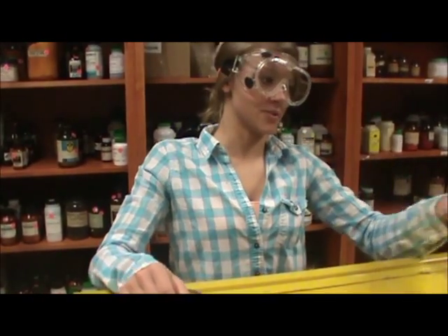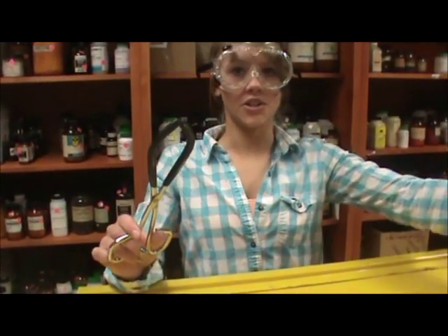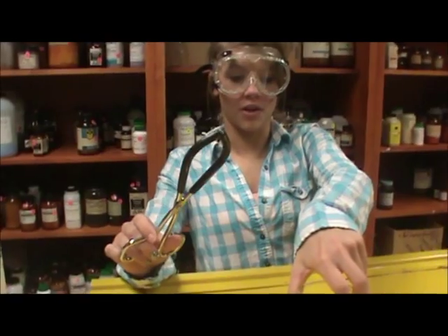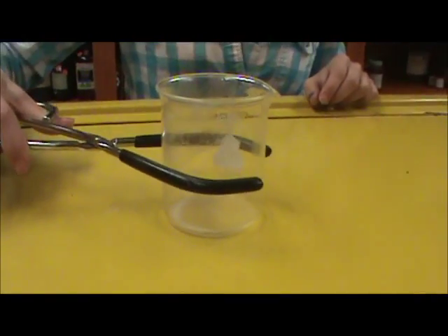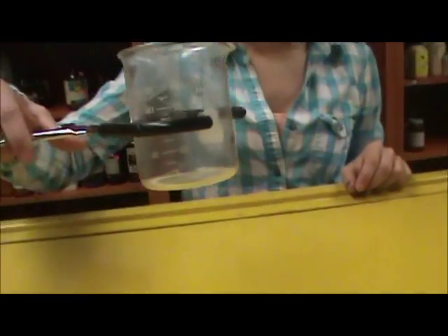Using beaker tongs versus crucible tongs. Beaker tongs are used to pick up a beaker when it is too hot. To do this, you open the tongs, squeeze around the middle of the beaker, and pick it up.